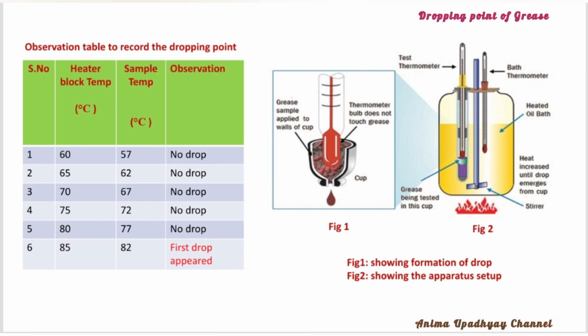The figures you can see here, in figure 1, the formation of the drop is clearly shown to you, how the drop is formed and how it comes out from the orifice, and in figure 2 the complete setup of the apparatus is shown very clearly.